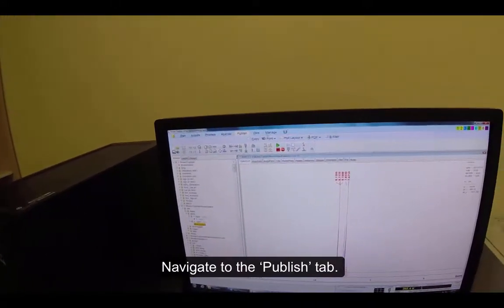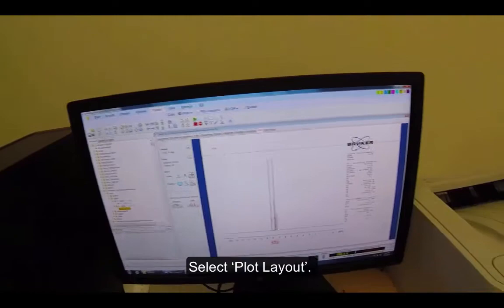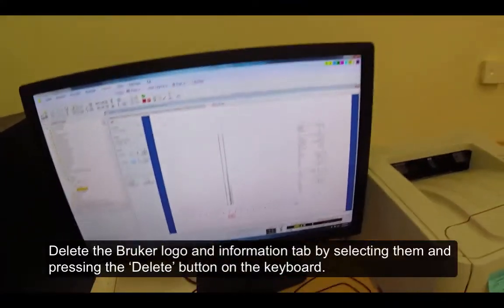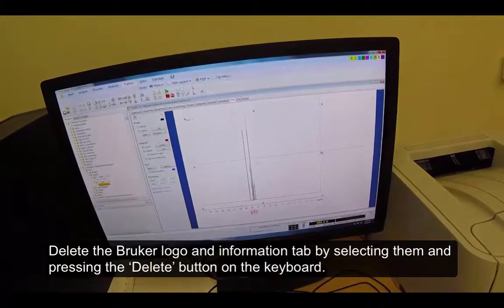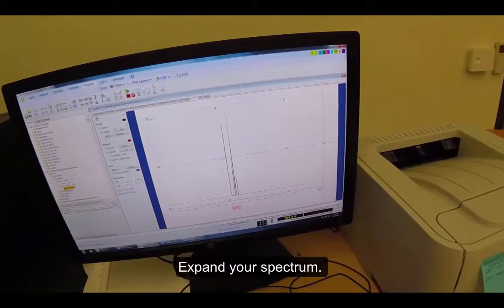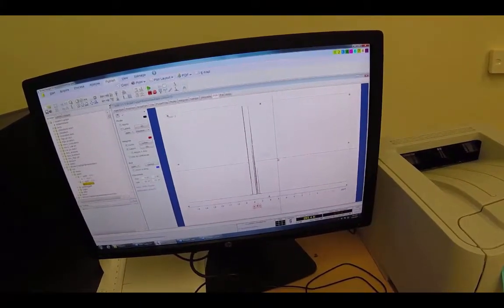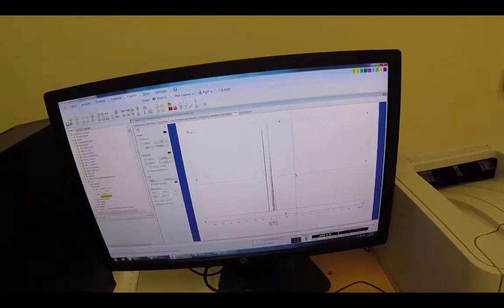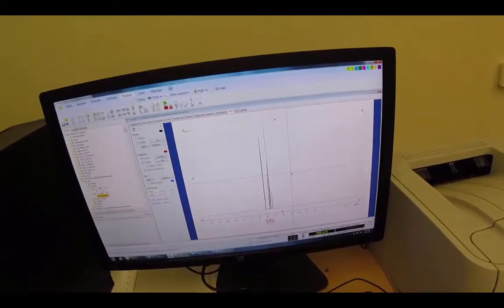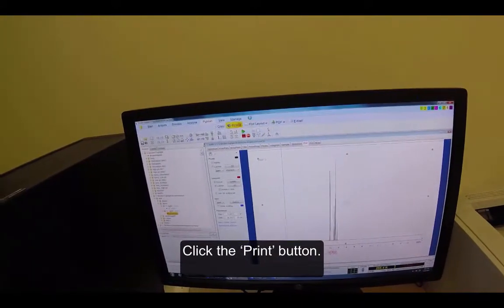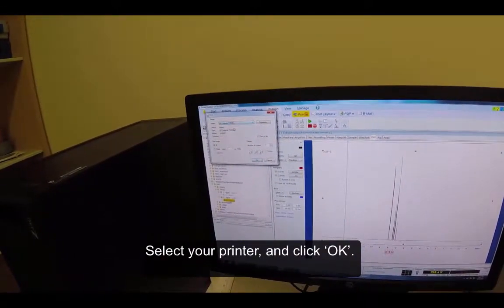Navigate to the Publish tab. Select Plot Layout. Delete the Bruker logo and Information tab by selecting them and pressing the Delete button on the keyboard. Expand your spectrum. Click the Print button. Select your printer and click OK.